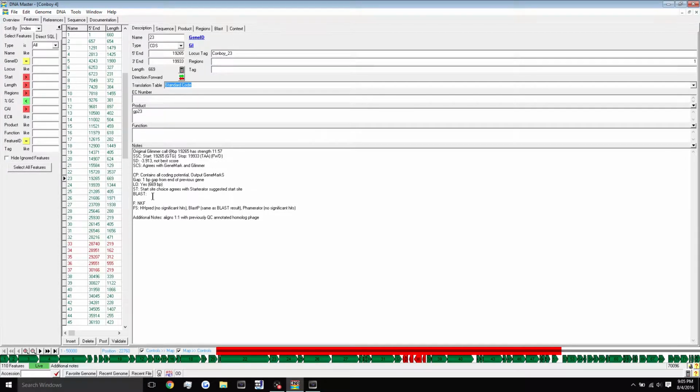In the last episode I showed you guys how to do the start site, the start codon, stop site, stop codon, gene orientation, the SD score, the SCS section, as well as the gap and the longest open reading frame. Today I'll show you guys how to fill out the BLAST section, the HHPred section, the BLASTP section, and the additional notes with the Phagesdb website.